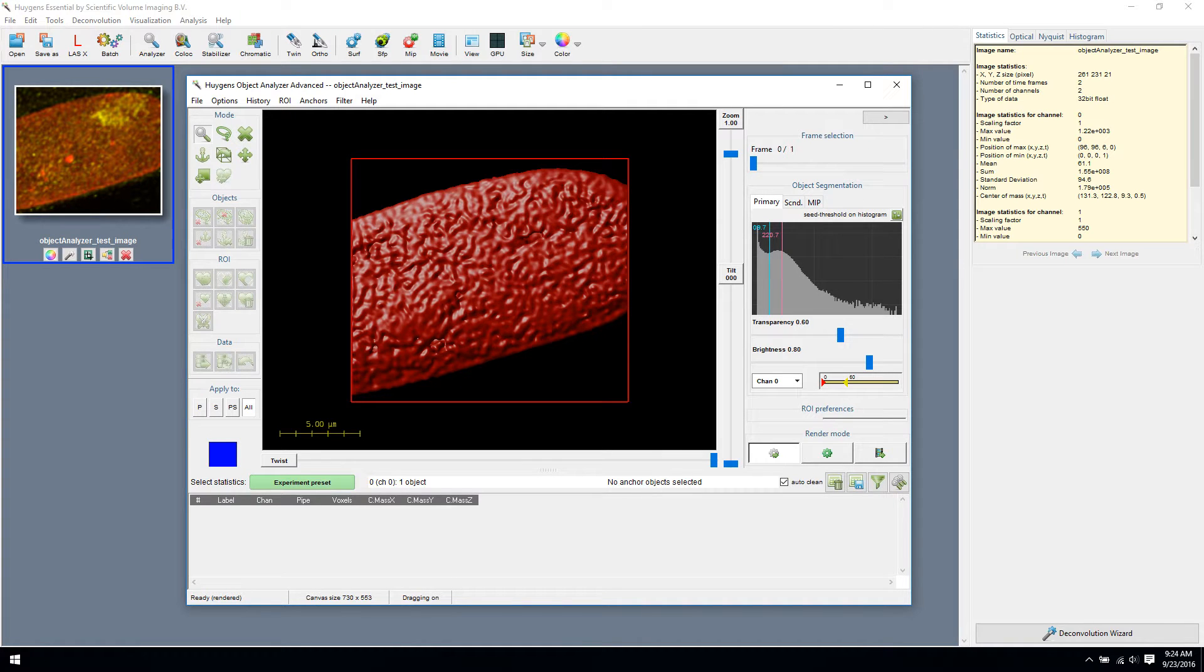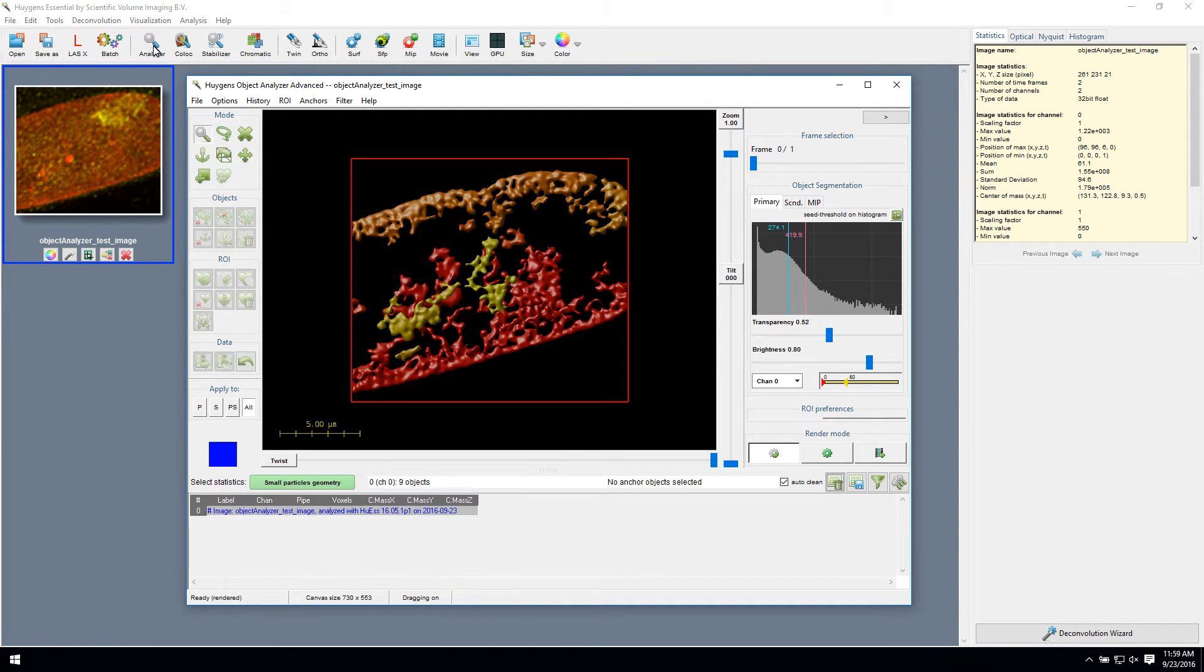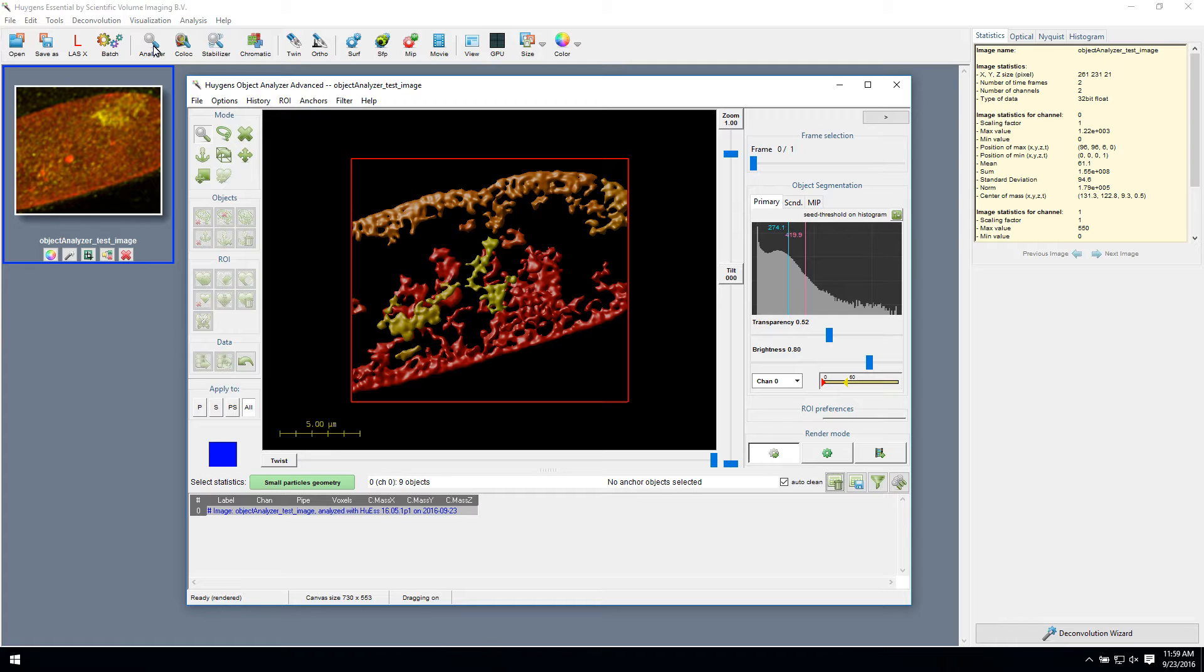Now we will present you with an example. First, we move the threshold, giving us three separate objects to analyze. If you want to make any changes to the objects whatsoever, there are helpful menus like ROI, anchors and filters, in the top left.